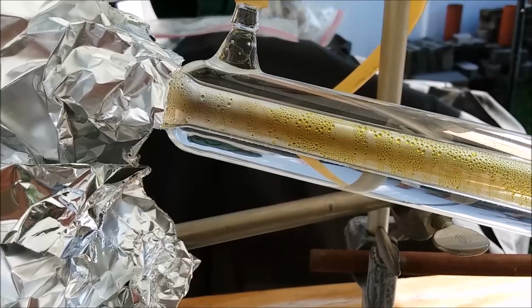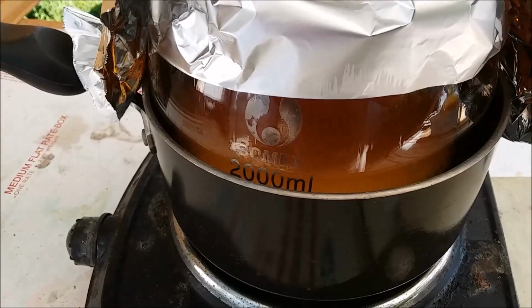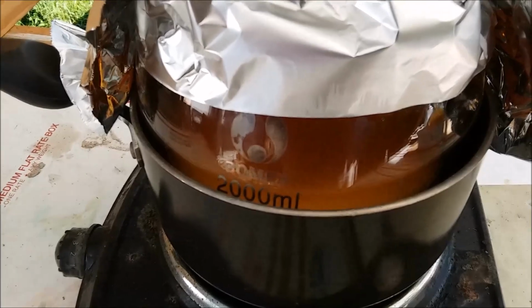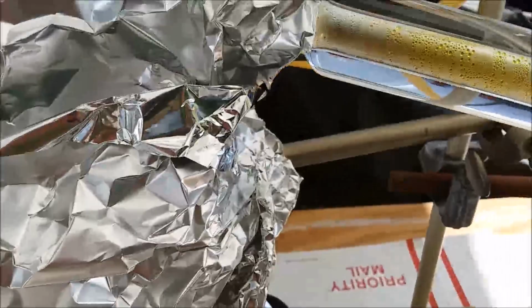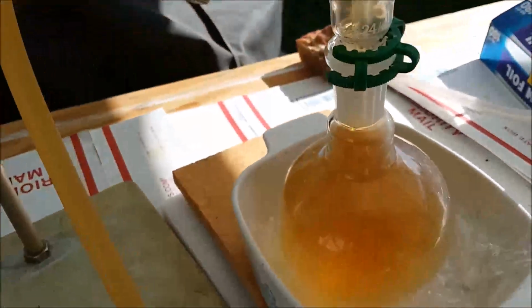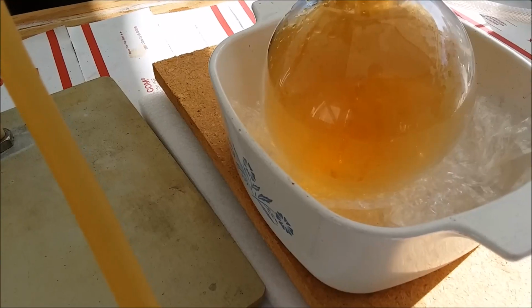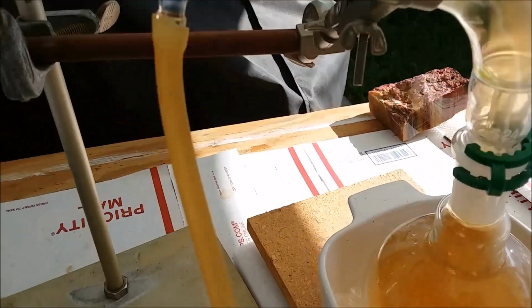Alright, the reaction is going along nicely. I don't know if what's going on in the boiling flask is showing up on the video or not, but the reaction is going along nicely. Getting lots of condensation up here in the condenser. Concentrated red fuming nitric acid dripping into the receiving flask.